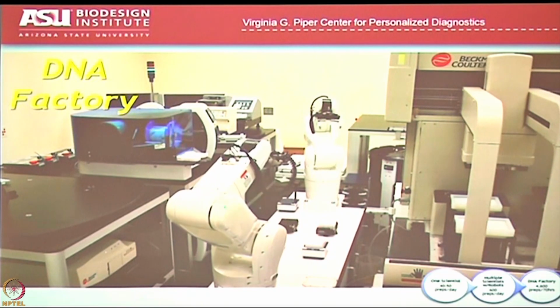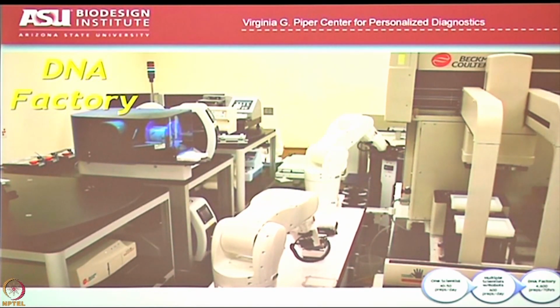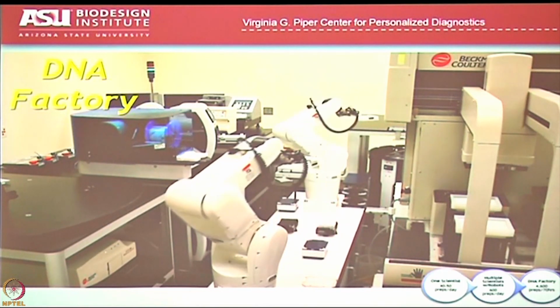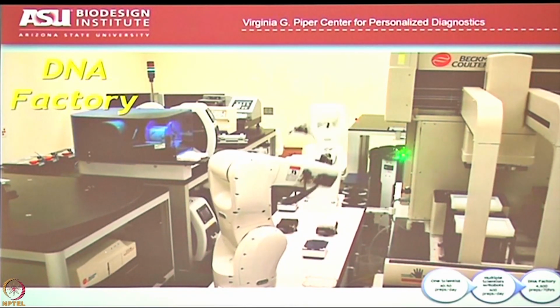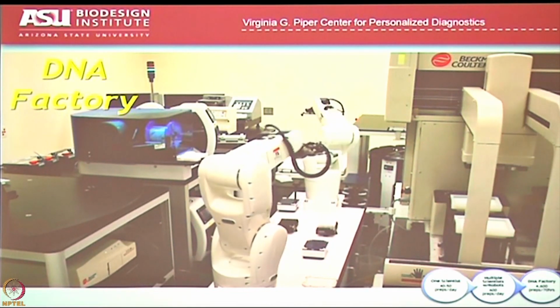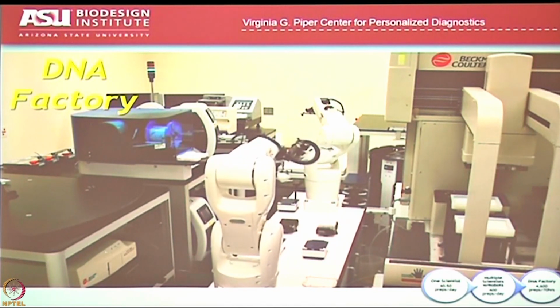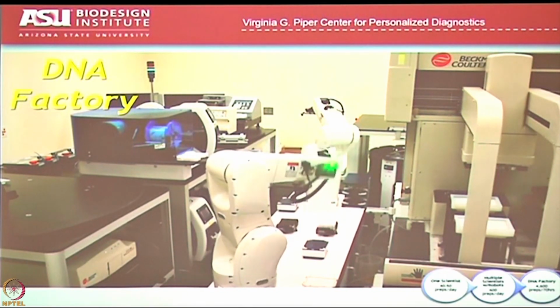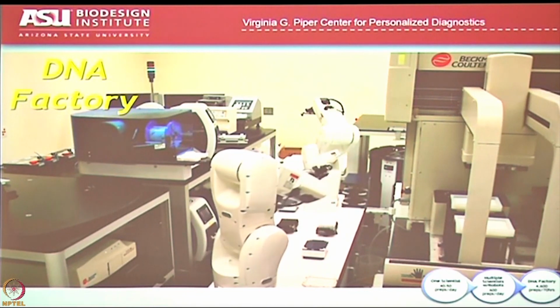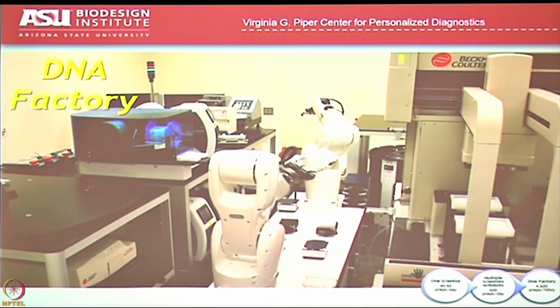So this guy's handing it off to this guy. So he's going to pick it up now. But they can pass it back to the centrifuge, which is right there. There's also a freezer, which is right over here, that stores the pellets after they've been grown. And then this liquid robot over here will purify the DNA from the bacterial pellets. You can see this guy's mixing by turning it upside down, just the way you would invert a plate. So the robots can do that for you if you want them to.